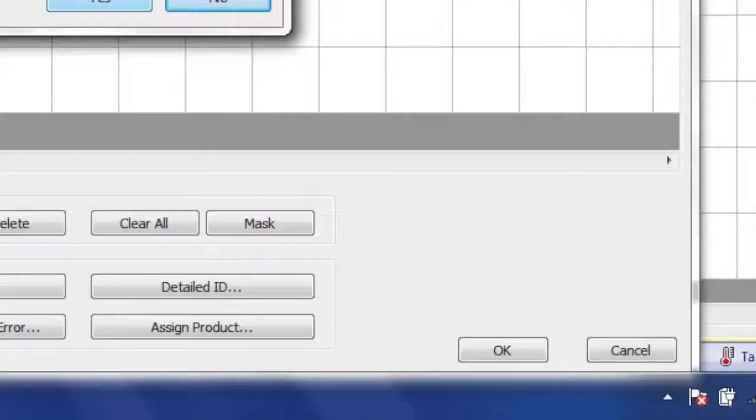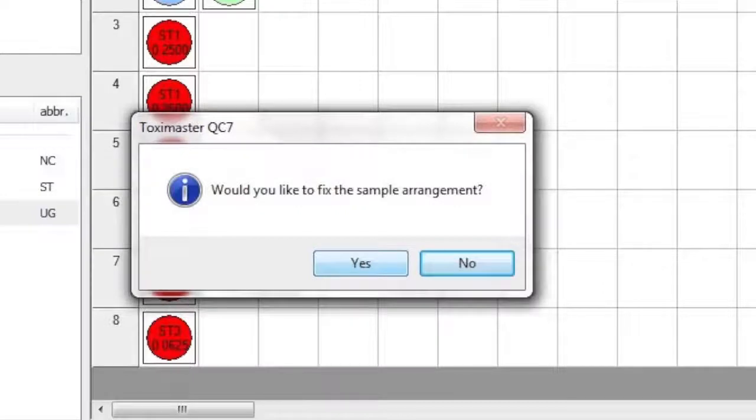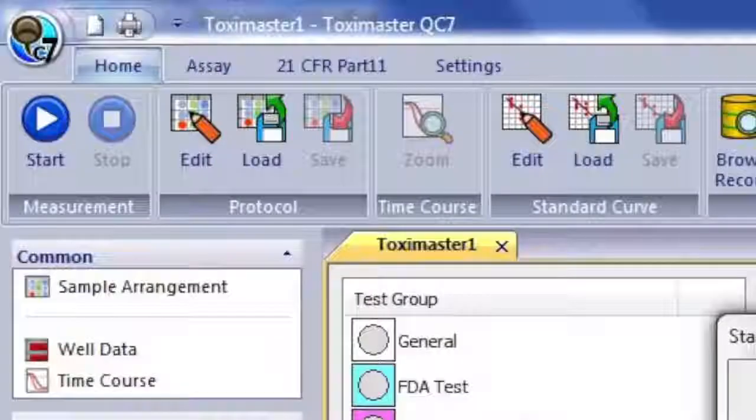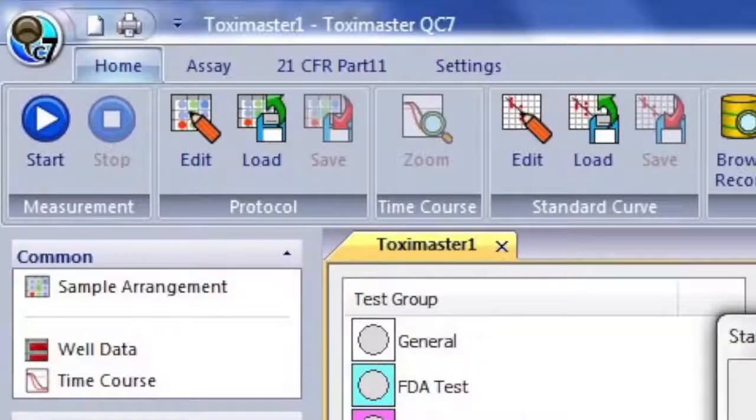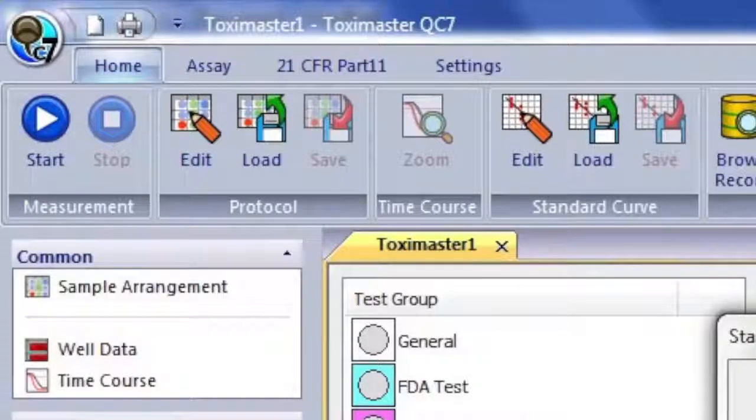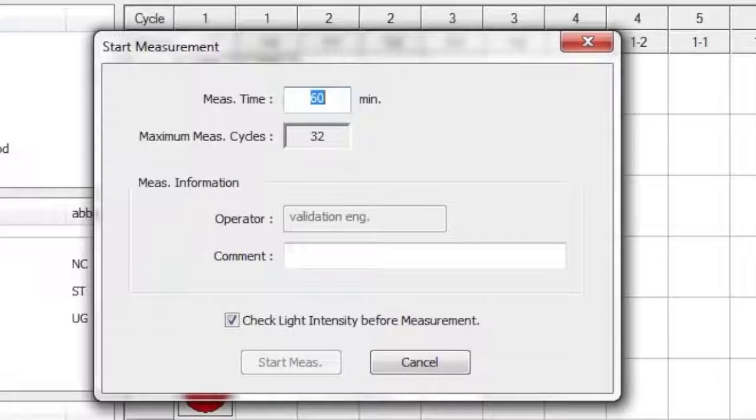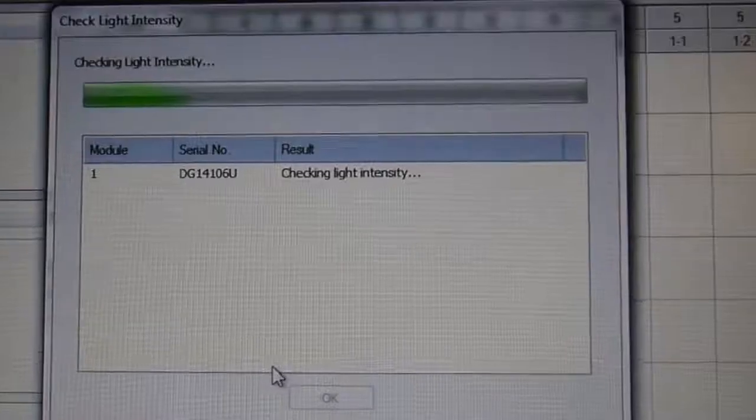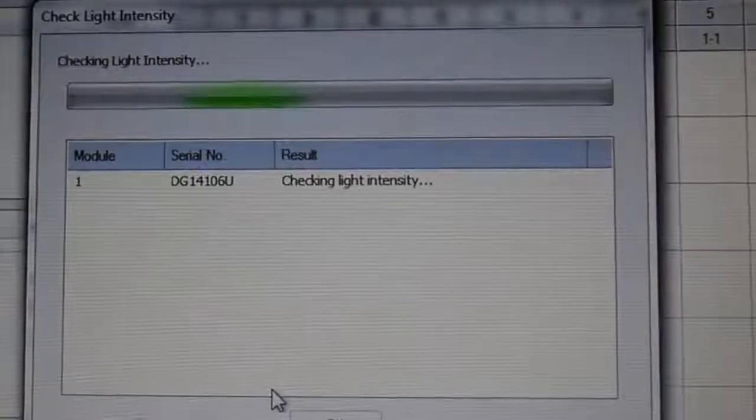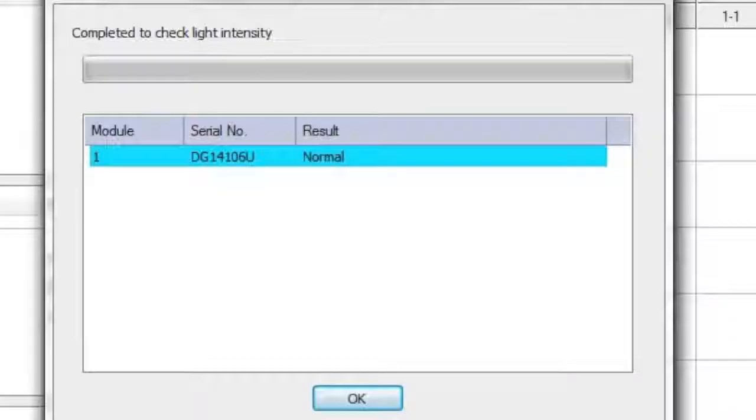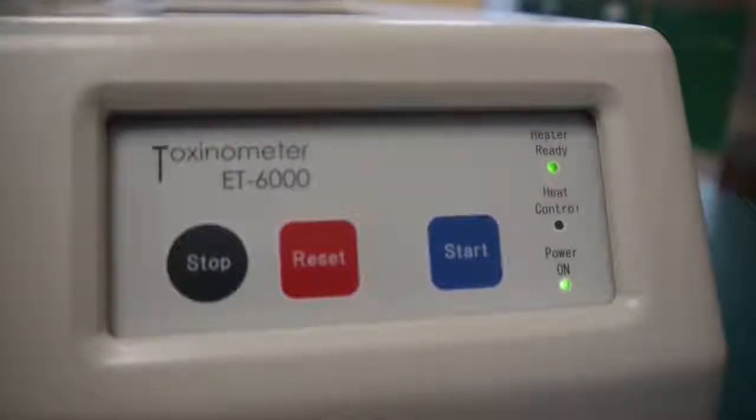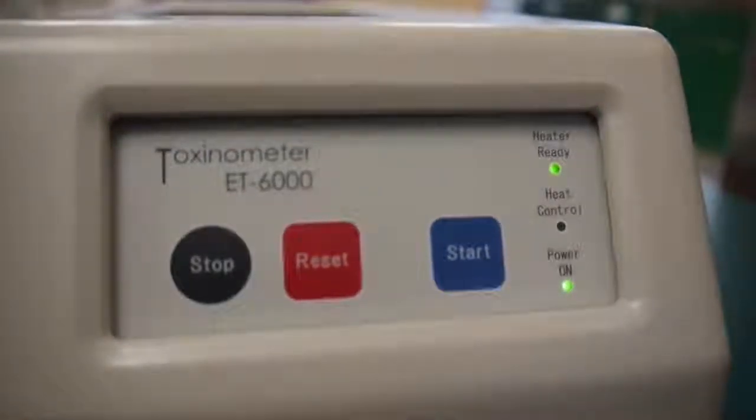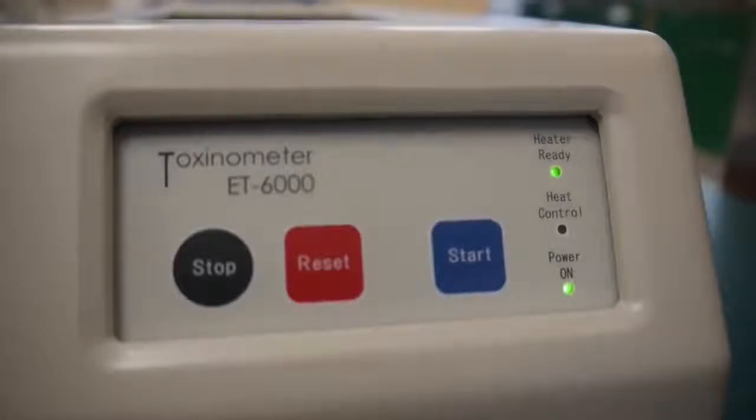We are able to give further identification to each sample using the Detailed ID button. Once your sample arrangement is complete, click the OK button. You will then click Yes to complete the sample arrangement. Now that your samples are arranged, click the Start Measurement button. You will be prompted by the Start Measurement box for which you can enter commands on your testing. Once you click Start Measurement, the check light intensity will occur. You will be notified when the light intensity check is complete. Your toxinometer should now indicate that the heater is ready at the correct temperature.